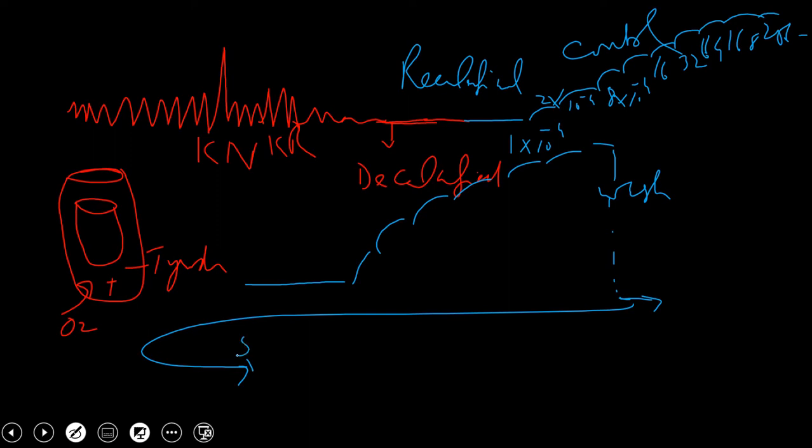So if I carry for you this here, then you give, for example, 5 microgram per ml, relaxing activity was there, so you add 5 microgram per ml final bath solution of F9 molecule to this tissue already being suspended here.